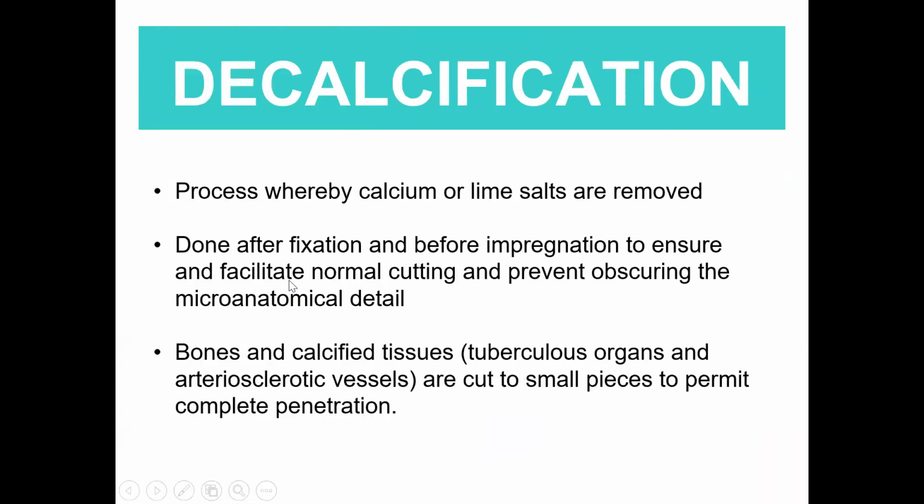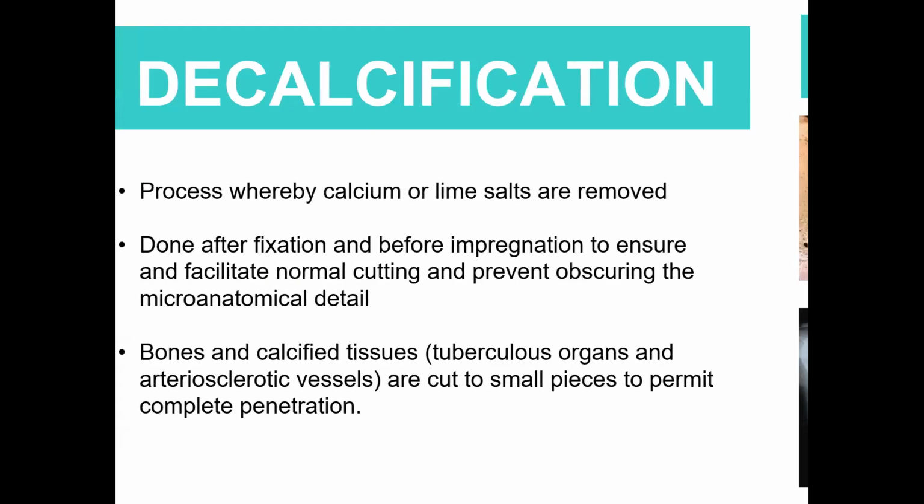When you say decalcification, this is the process whereby the calcium or lime salts are removed. This is done after fixation and, of course, before impregnation, which will facilitate normal cutting and prevent obscuring the microanatomical detail. Bones and calcified tissues, especially those that have suffered from pulmonary tuberculosis or those that have atherosclerotic diseases, are cut into small pieces to permit complete penetration of your decalcifying agents.